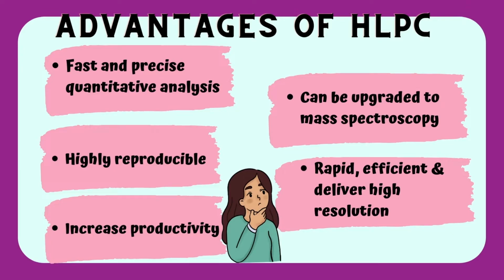It forces a liquid solvent through a solid absorbent material using a pump rather than gravity, with various chemical components spurting out as they pass at different speeds. The procedure takes around 10 to 30 minutes to finish and produces great resolution. It is precise and very repeatable. Basic HPLC runs may be conducted with little training because it is mainly automated.